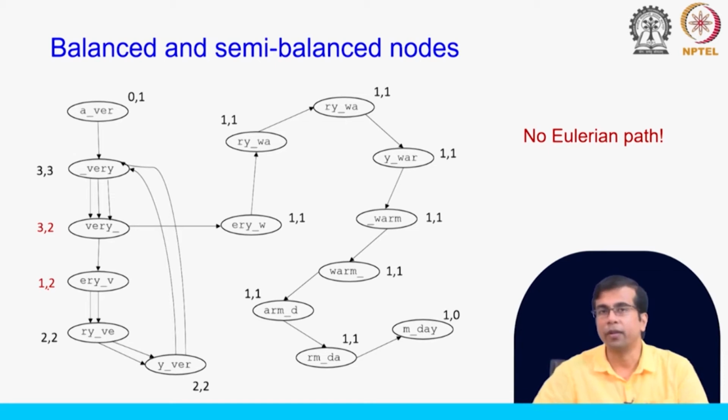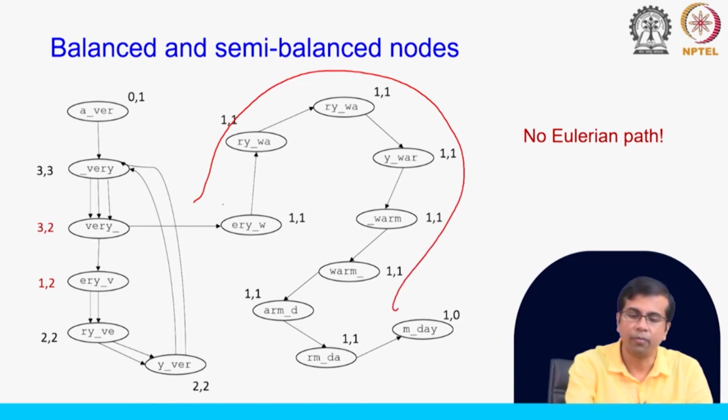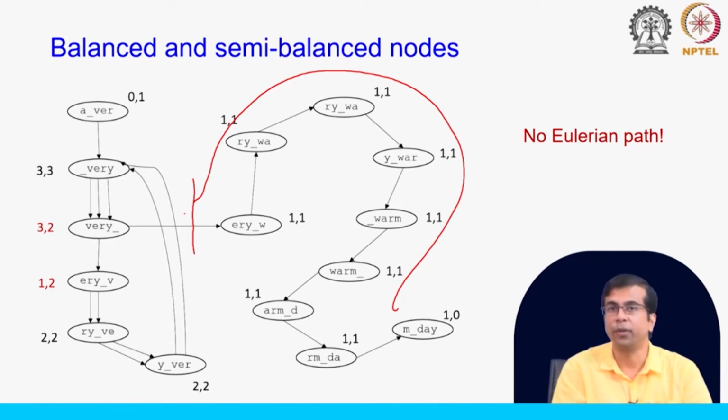Maybe some part of the graph will be Eulerian, maybe you can disconnect certain parts. You can probably see, maybe this right part here, if you remove this edge, you can see this part of the graph will be Eulerian. So, you can derive the reference sequence.